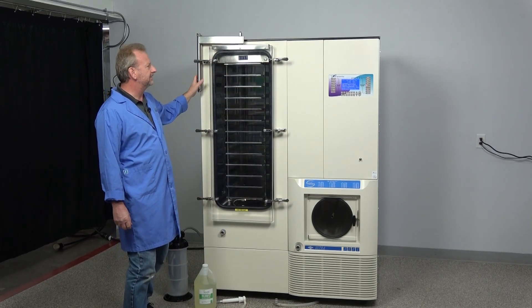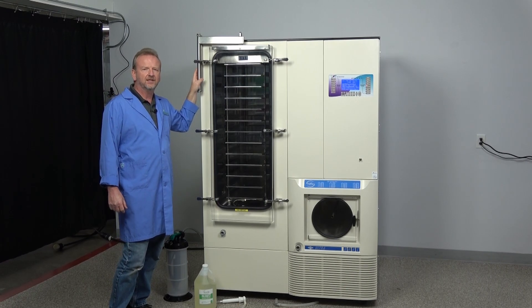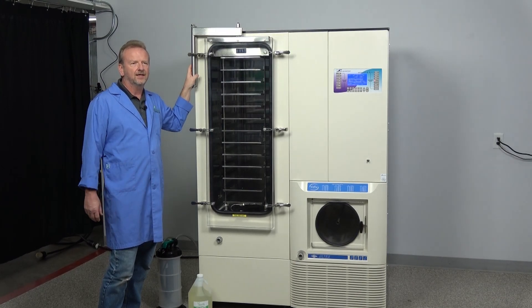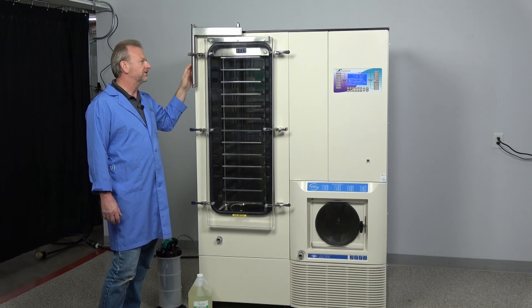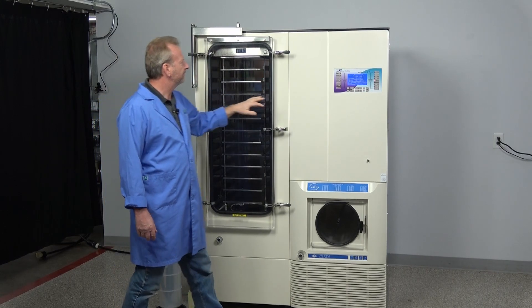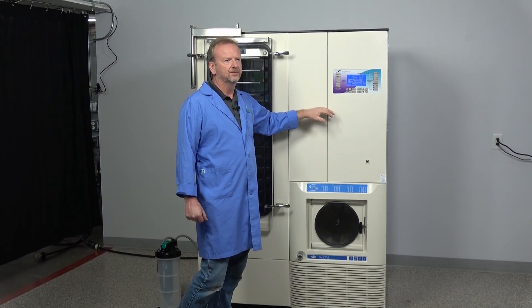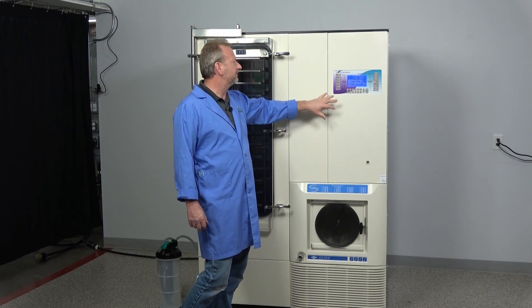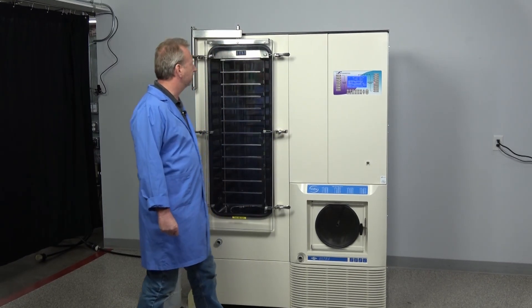The older machines, if you aren't familiar with, actually had PLC systems running them where you could integrate them into an assembly line or a production line of some sorts. But it didn't work very well with just laboratory use. So having this Wizard 2.0 where you can actually put in all your parameters, put in your recipes and save them — you've got about a hundred you can save — gives you a real easy, user-friendly option to actually do a lot of freeze drying.